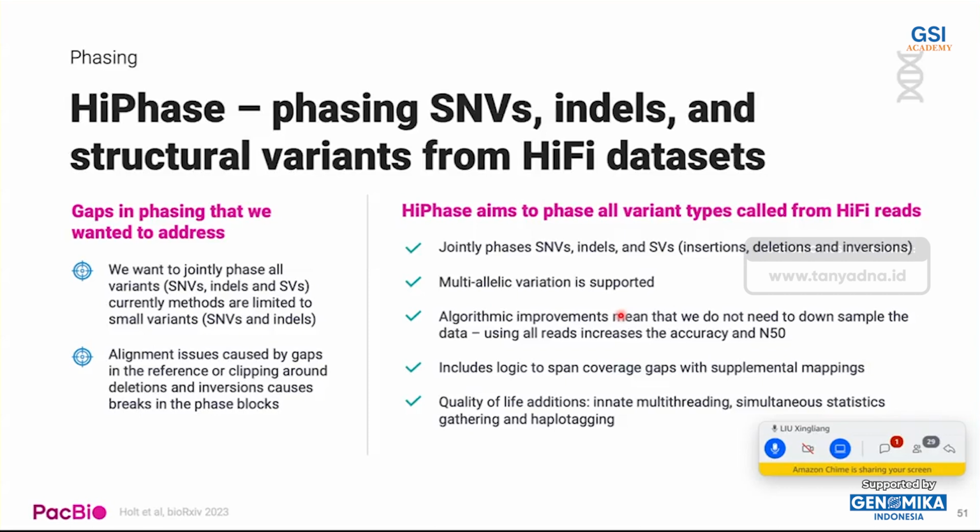Another interesting topic in rare inherited disease study is that people of course want all of the variants to be fully phased, right? Because we want to look at the inheritance events that might be shared with the parental, might be derived from the parental alleles.